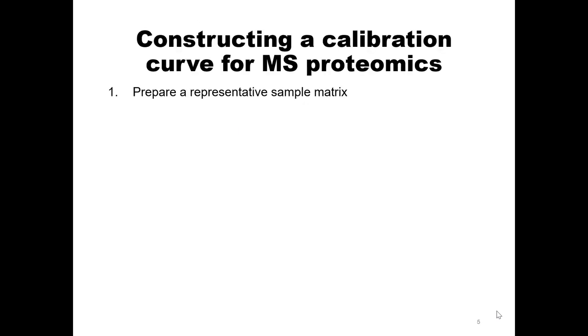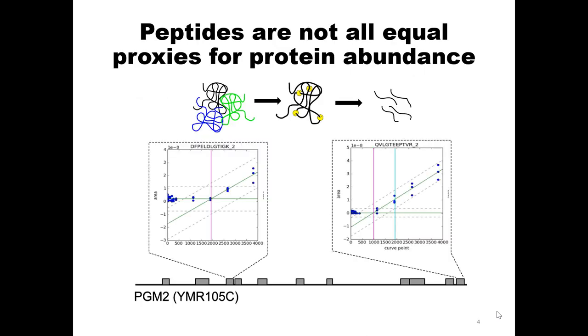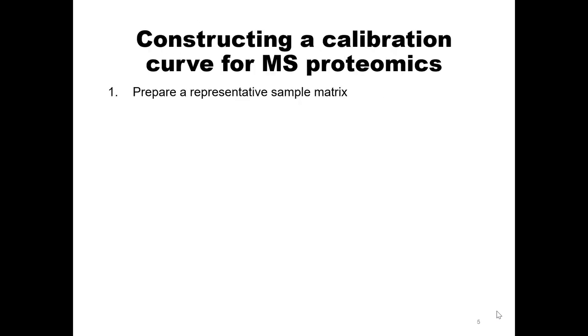We're going to talk now about how you actually make these X values, these X samples. So does everyone feel properly oriented to talk about X values? Yeah? So one of the first points, just to start out with, is that you have to have some representative sample matrix to bake your curve in.